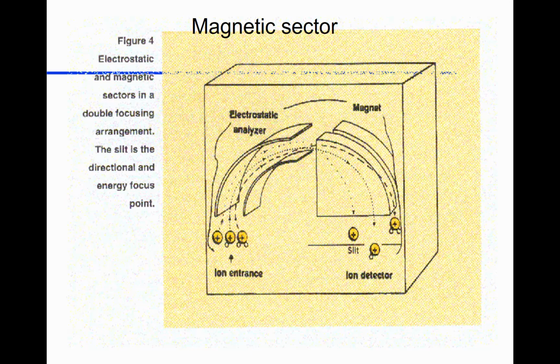It fell into disfavor, so it's a really good detector in terms of its ability to an accuracy. With this type of magnetic sector separation, you can get accurate mass. You get elemental formulas. I can get a formula that says I know exact elemental composition. And so that's really a nice thing. I know what atoms are involved in my molecule. That isn't true of some of our other techniques. So it's what we call a high-resolution instrument. We'll come back to that a little bit later too.